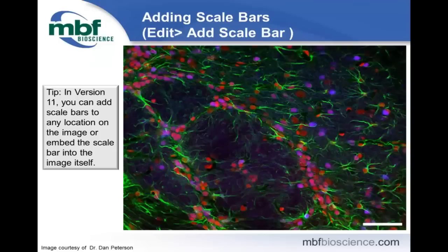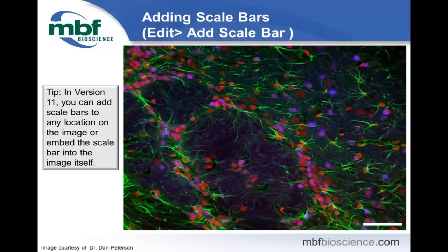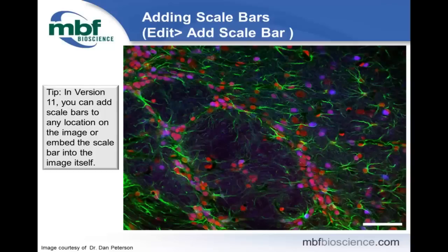Once you've made image adjustments to your satisfaction, a common next step is to add scale bars so viewers know how big these objects are. In version 11, we've dramatically changed how you can add scale bars — you can now modify them, place them at any location in your image, or embed them into the image itself. Previously in version 10 and earlier, the scale bar was simply part of the image. Now we can specify the color, the size, and the location, and choose whether or not to add it to the image itself.